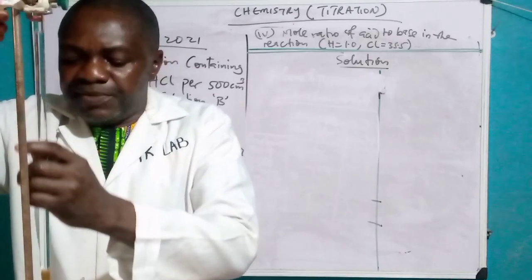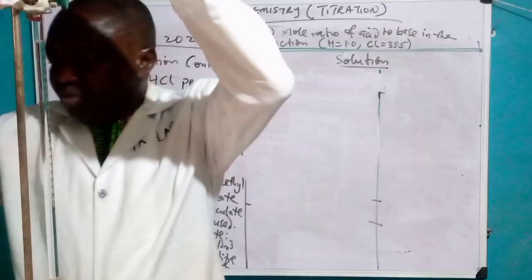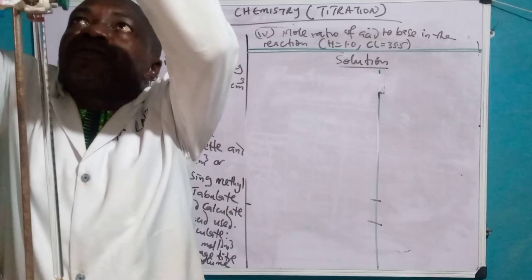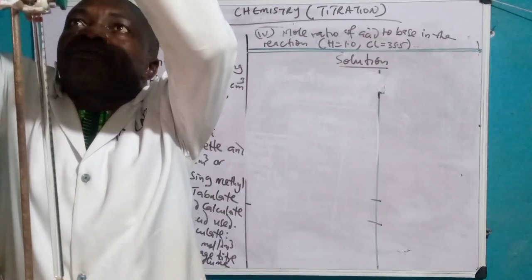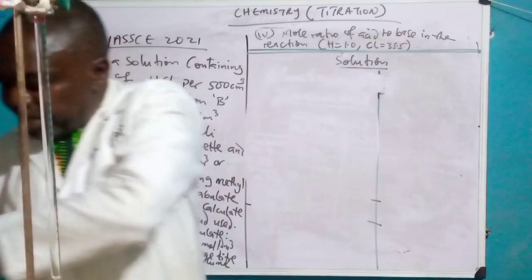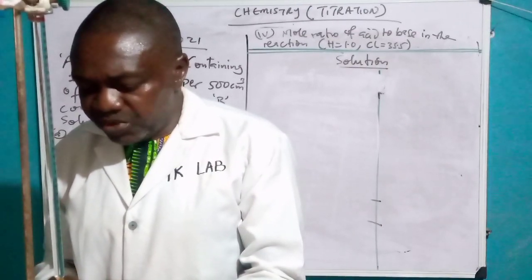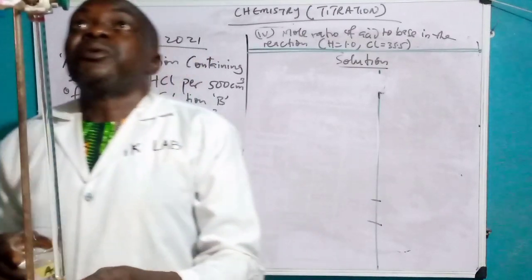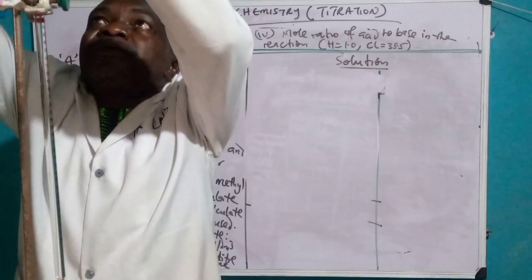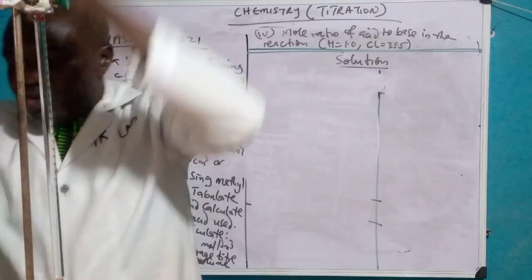Let's reduce it. It's too high. Continue to add it till it gets to the 0 mark. Okay, it's at the 0 mark, but it is not at 0. You have to readjust it to remove the air bubbles. Okay, just very straightforward. So I'll now refill it because it has reduced. I'll refill it now. We went beyond it, so I'll readjust it again.